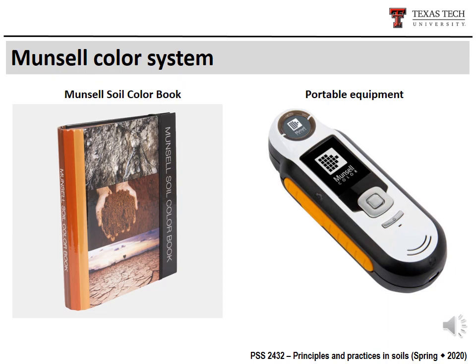To measure the color of any surface you want, based on the Munsell color system, you can purchase, you can buy the Munsell soil color book.